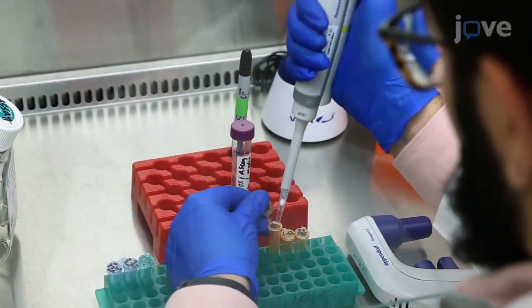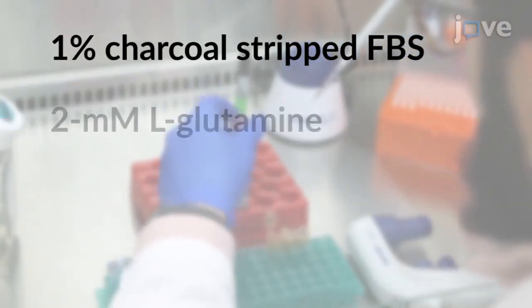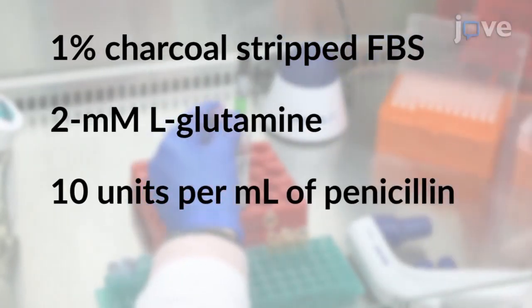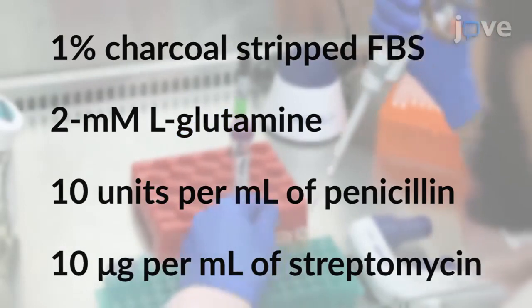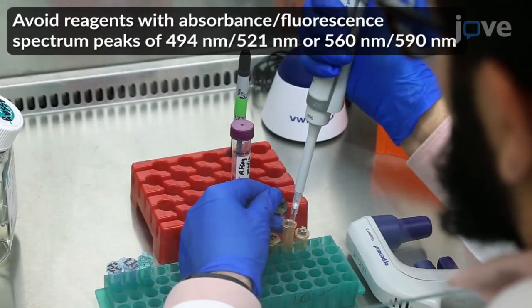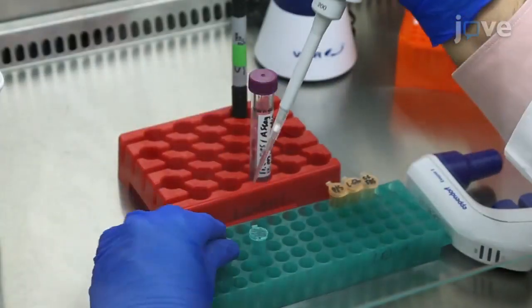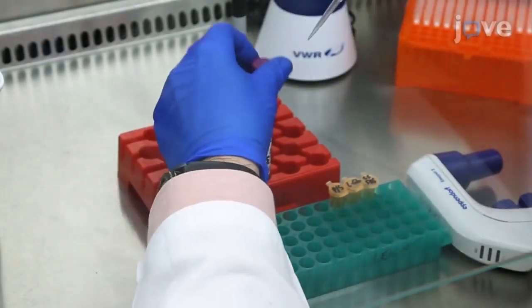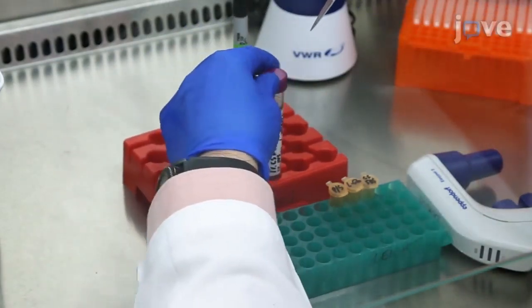To begin, prepare the assay media with 1% charcoal stripped fetal bovine serum, 2-millimolar L-glutamine, 10 units per milliliter of penicillin, and 10 micrograms per milliliter of streptomycin. Do not use phenol red media, which has more fluorescence interference. To make positive controls, add bacterial collagenase enzyme type 1 to the assay media at concentrations of 10 and 1000 micrograms per milliliter.